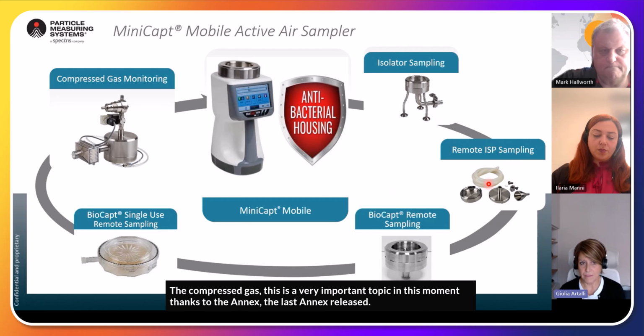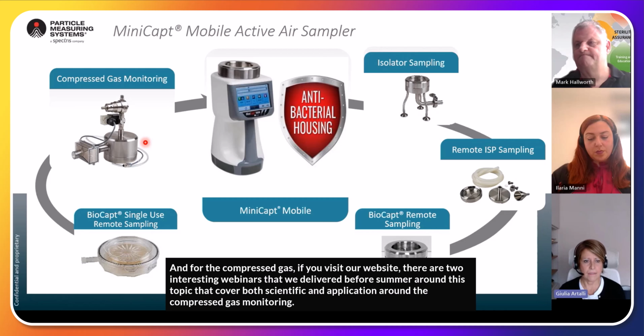The compressed gas. This is a very important topic at this moment, thanks to the Annex, the last Annex released. And for the compressed gas, if you visit our website, there are two interesting webinars that we delivered before summer around this topic that cover both scientific and application aspects of compressed gas monitoring.